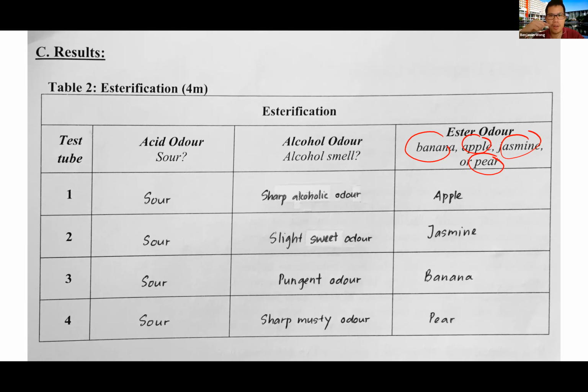Maybe for one week or a whole day you cannot smell anything, it will take some time to recover, or maybe it never recovers. So in the lab, please be extra careful. Never ever smell directly. Use your finger, the test tube here, and push the smell towards your nose so that the concentration won't be so strong. Remember that.